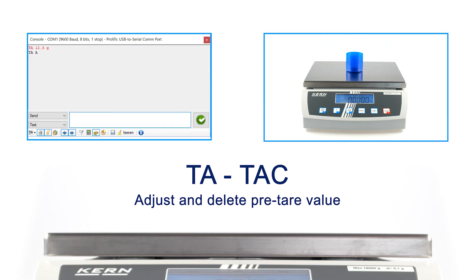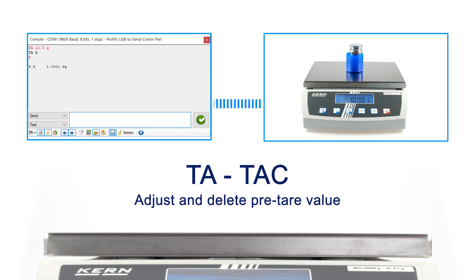After that, place the container on the balance. If you query the stable weight value now, you only get a measurement result without the container. The entered tare value can be removed with the TAC command.